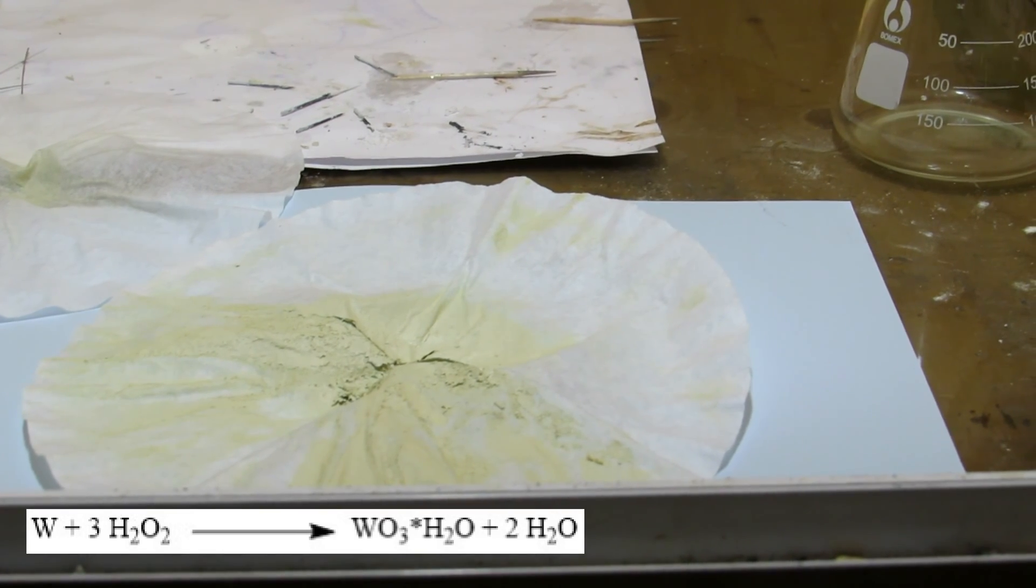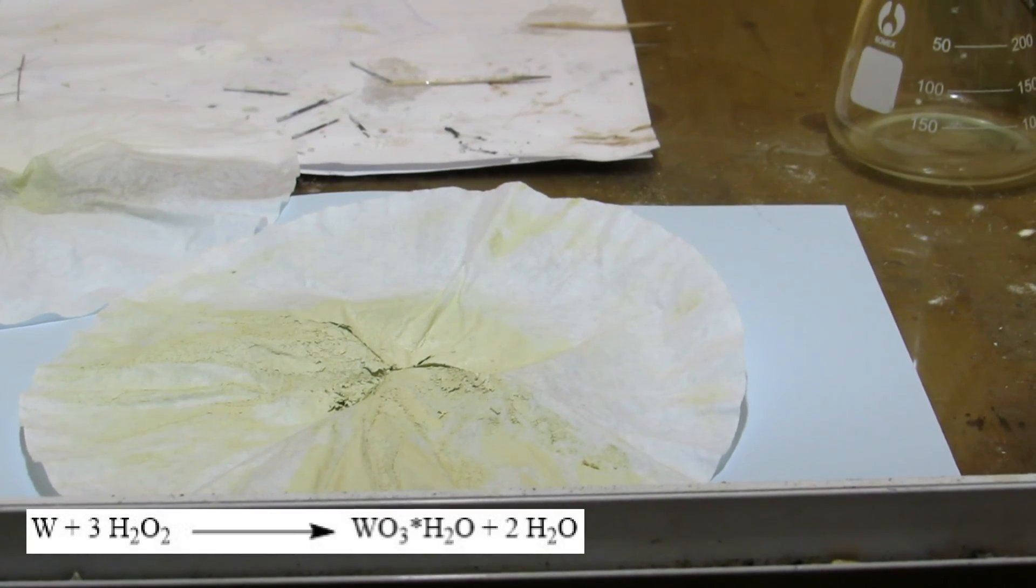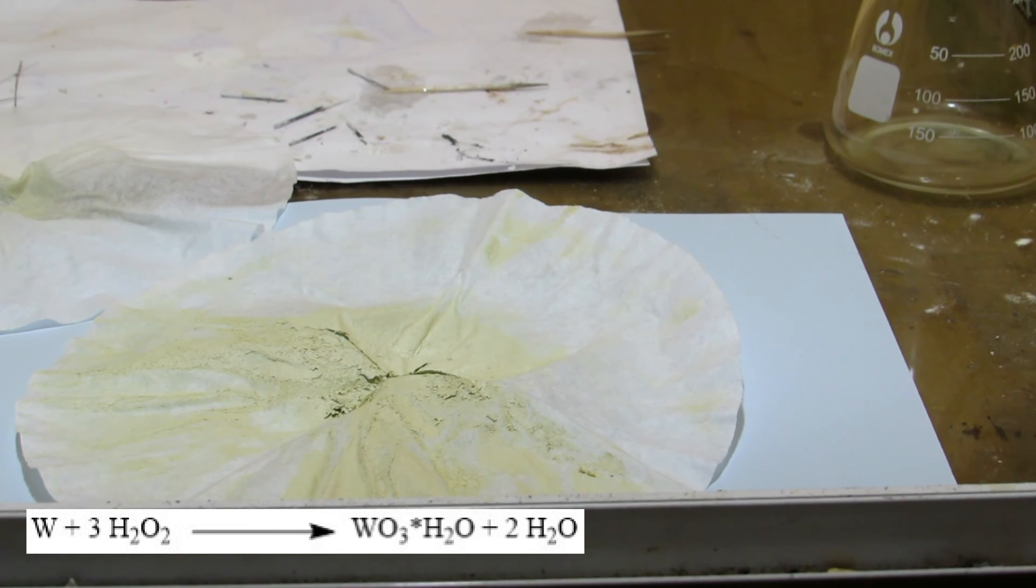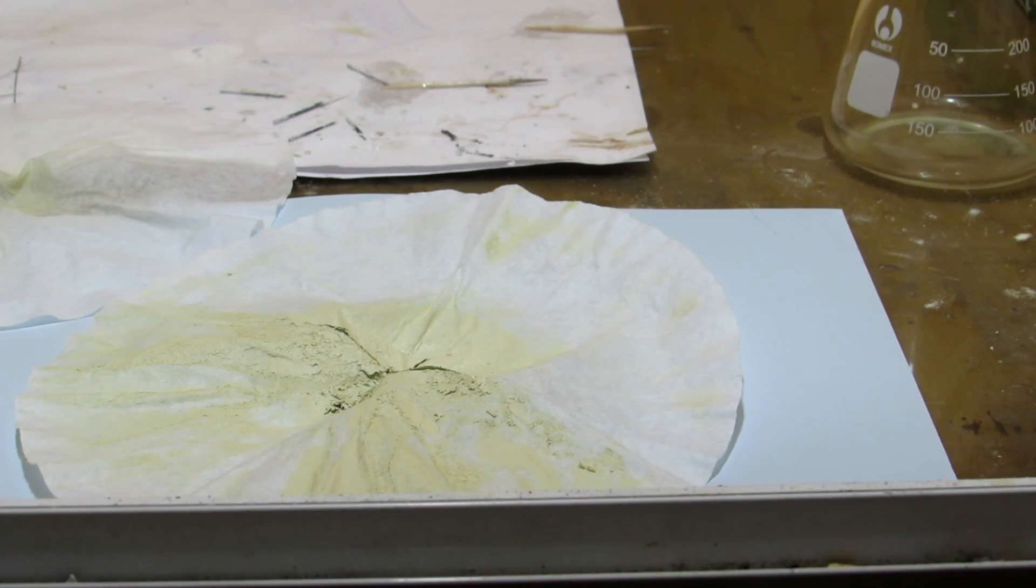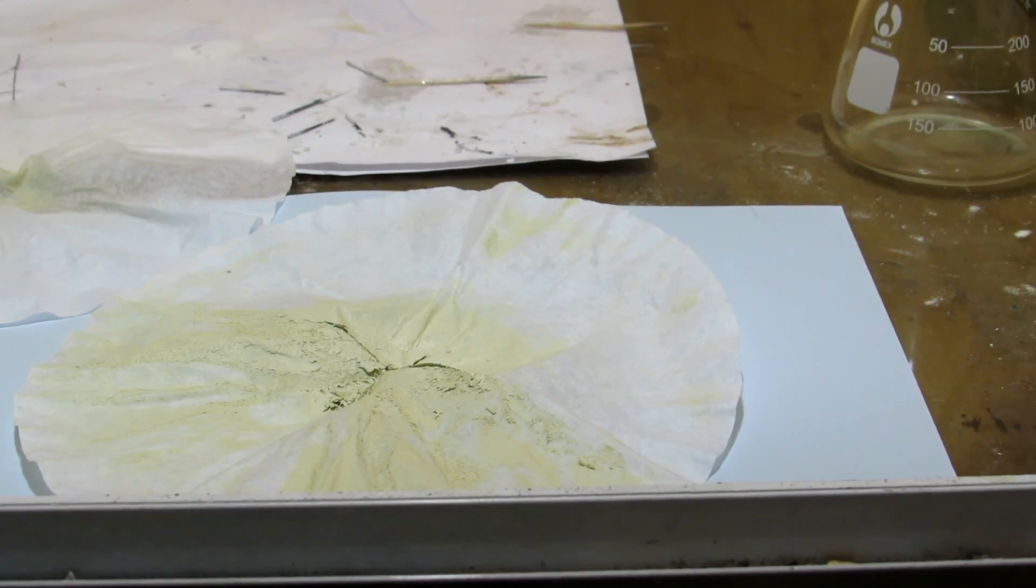After sitting in the hydrogen peroxide solution for a few days, the thorium dioxide powder lightened in color as the residual tungsten contamination dissolved. The thorium dioxide was filtered and heated to about 250 degrees Celsius to fully dry the powder.